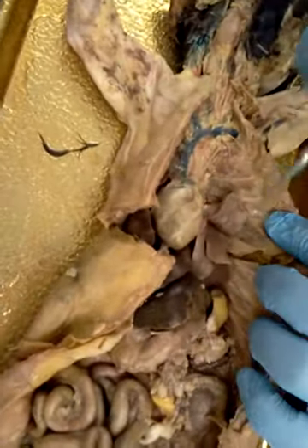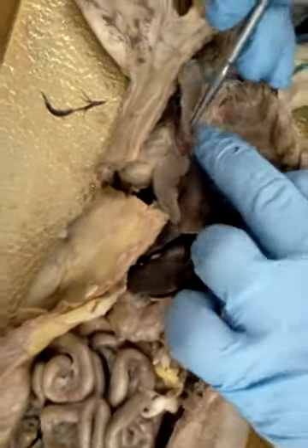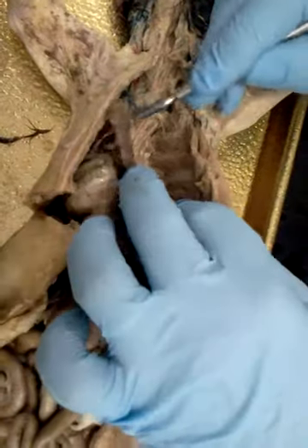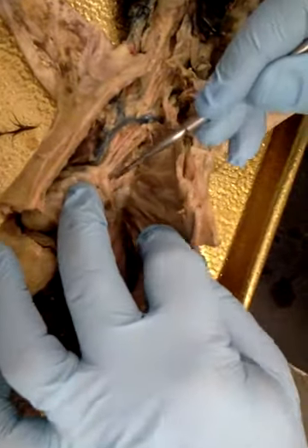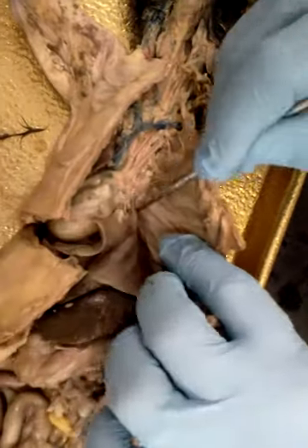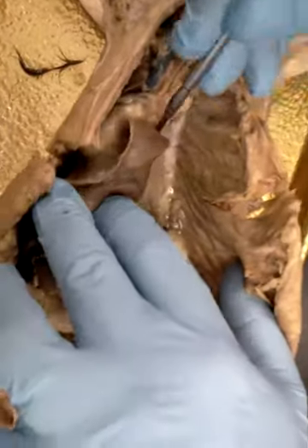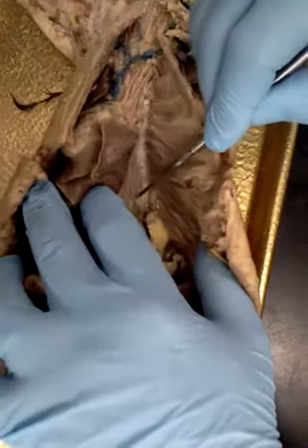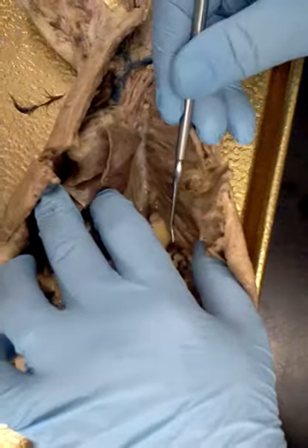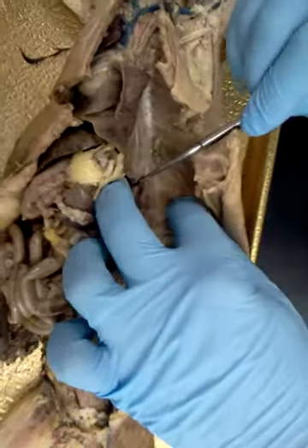Now let's go down through the body cavity. All right. Now as we go through the body cavity, here's the aortic arch. There's the aortic arch right there. It goes down into the thoracic aorta. There's the thoracic aorta. Once the thoracic aorta gets past the diaphragm, it now becomes the abdominal aorta.